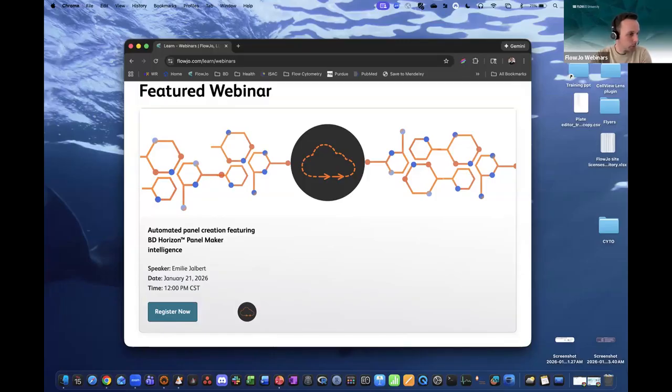All right, so recording webinar done. Is there a particular order to exclude the doublet? Should I do forward scatter first, then side scatter, or the other way around? No, there's no order. You can do it either way.